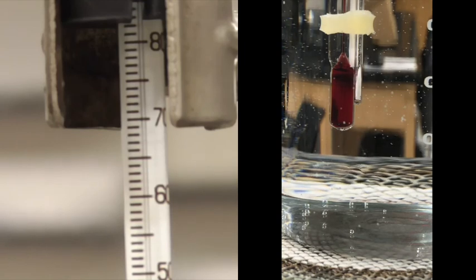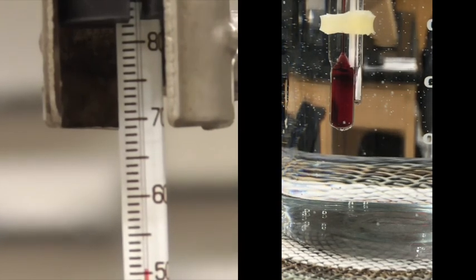We're moving up to about 50. From the camera on the thermometer, you should just about see the red alcohol coming into frame, and it just did. So we'll let it go for a little bit longer, and then we're going to slow it down a bit.